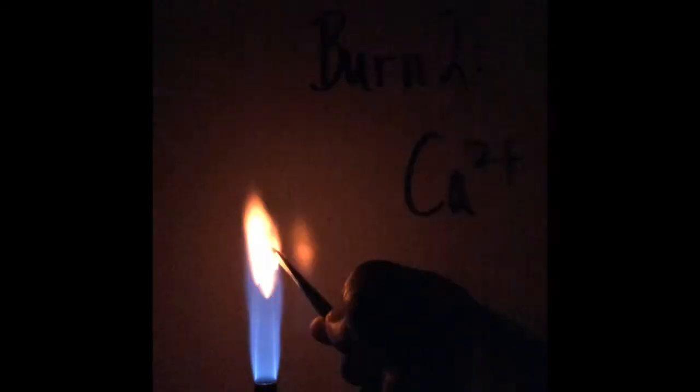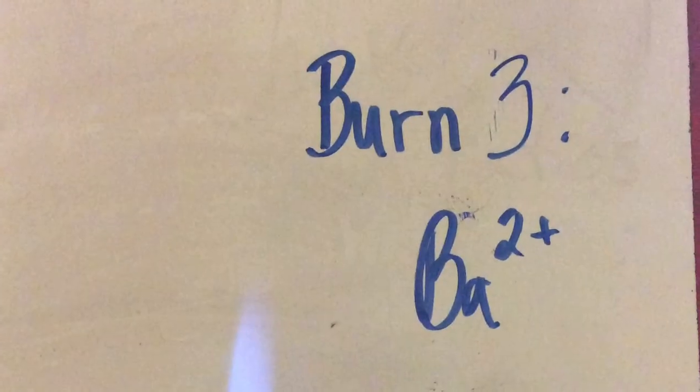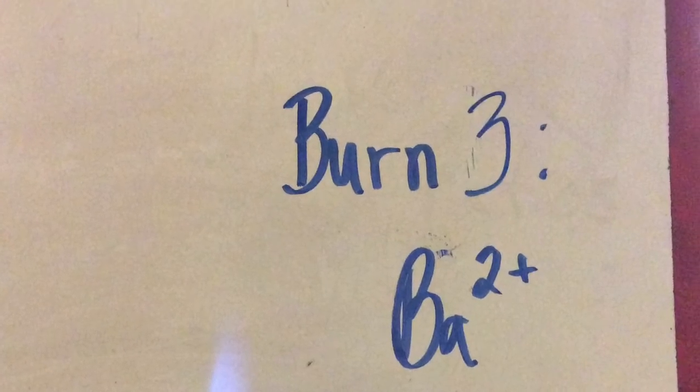Hopefully you can see that there's more of a red-orange burn from that than the normal flame. Here's burn number 3, barium.